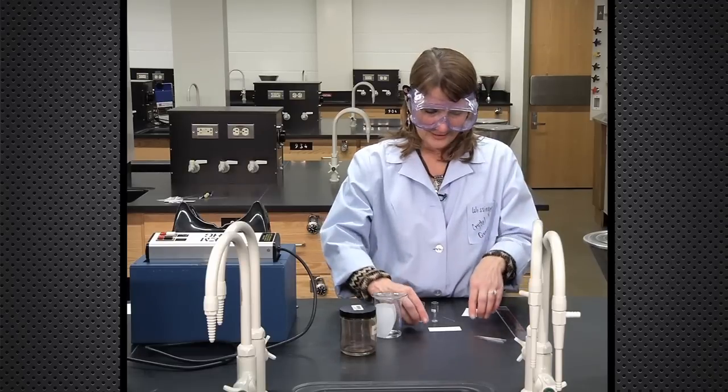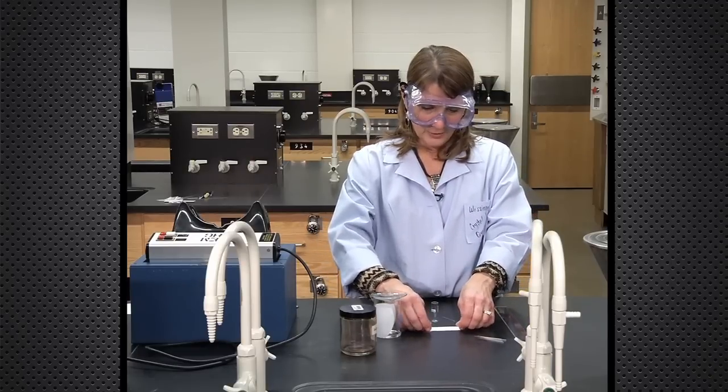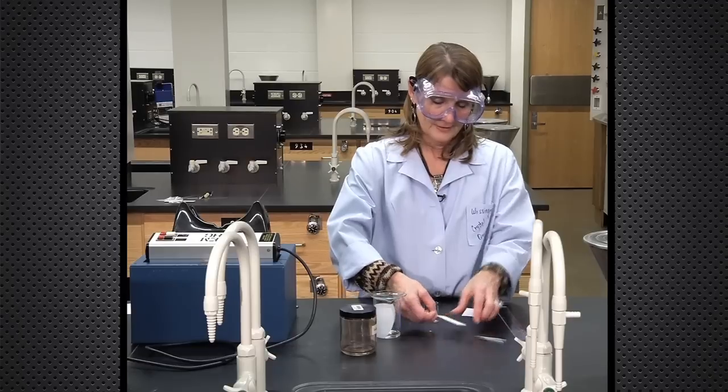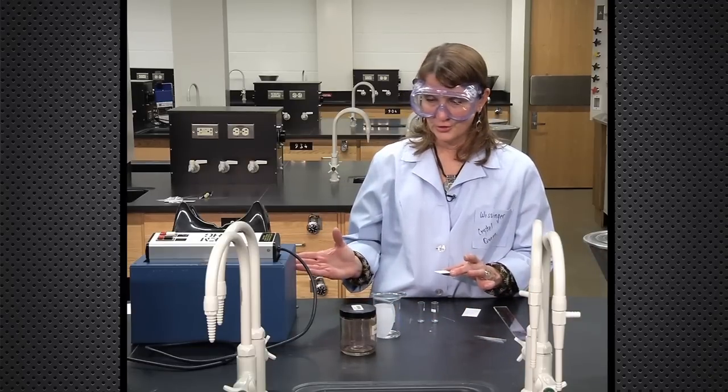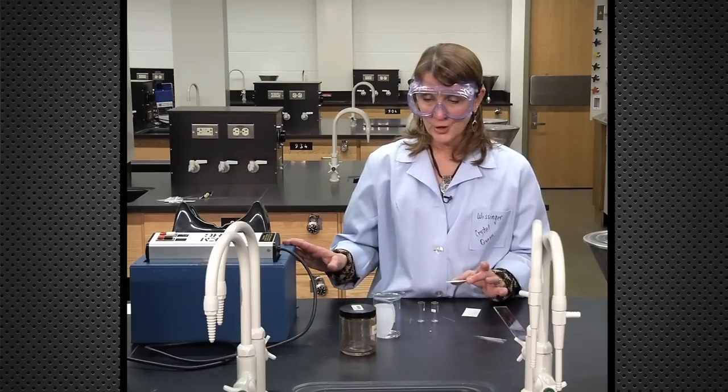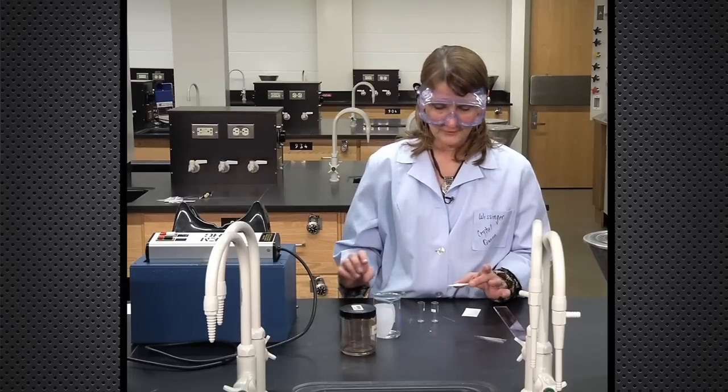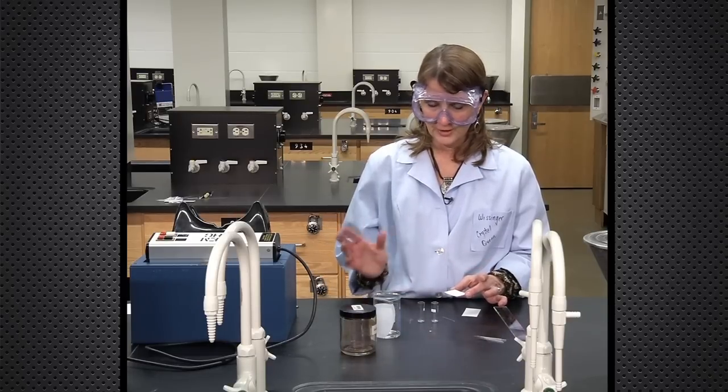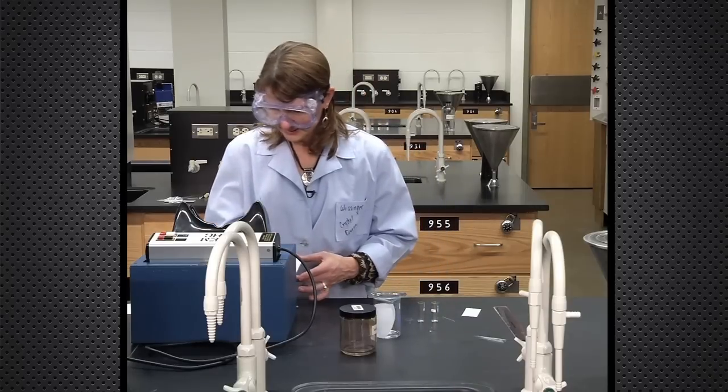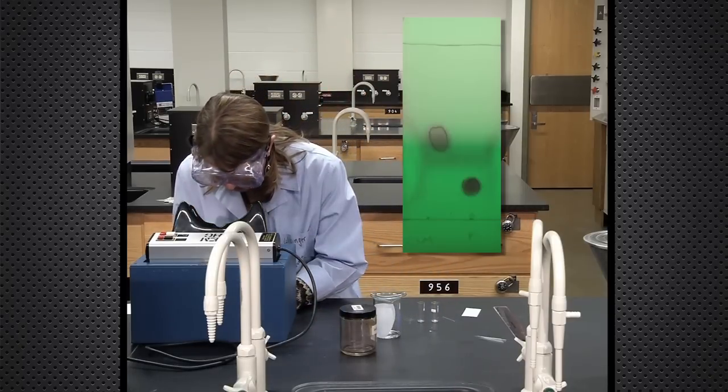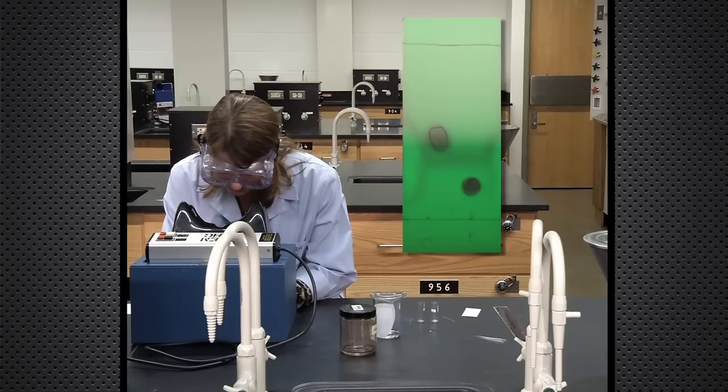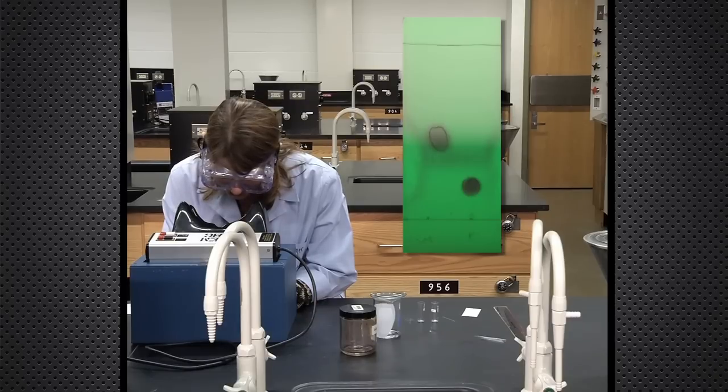Now the exciting moment has come where we're going to look at our TLC plate first under the UV lamp and then we'll put it in the iodine chamber. You want to do the UV lamp first so that the reaction of the iodine with the spots doesn't interfere with the UV visualization. So I'm going to put this under the UV light. Perfect. And circle each spot.